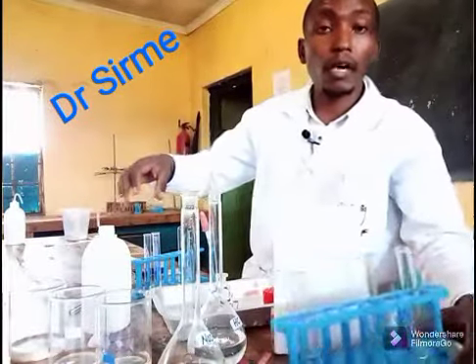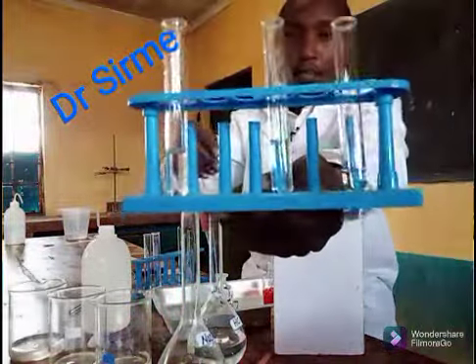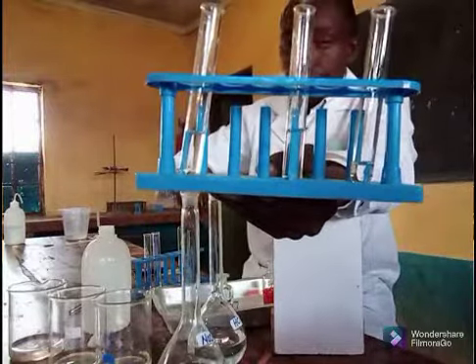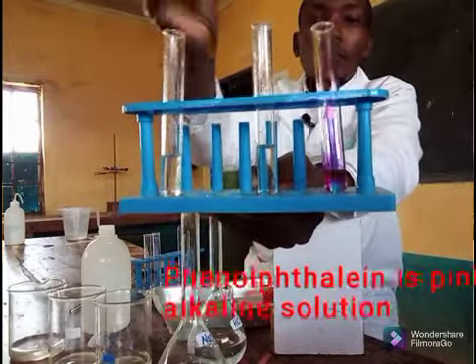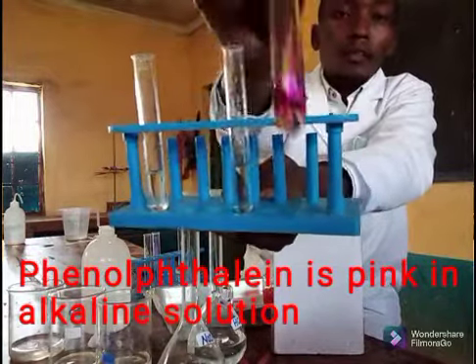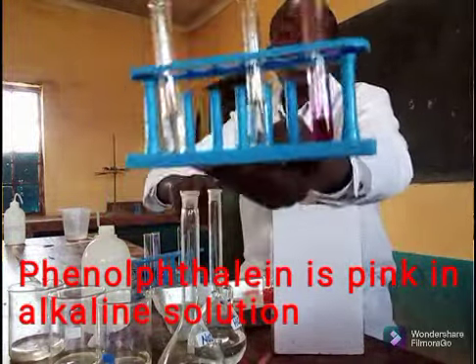And finally, I'll have some distilled water. So I'm going to add phenolphthalein to all of them. I hope you can see very clearly. Phenolphthalein indicator in alkaline solution has assumed the pink color.